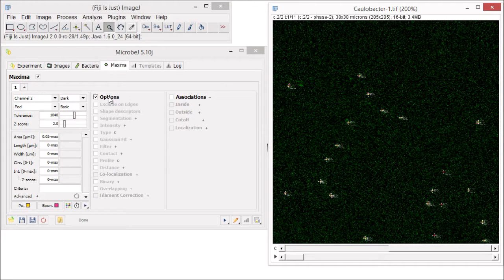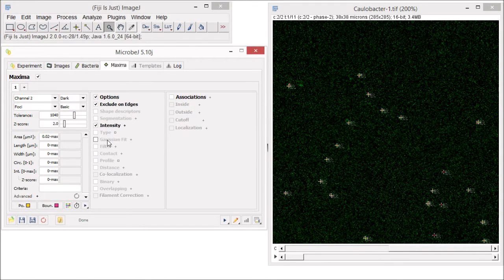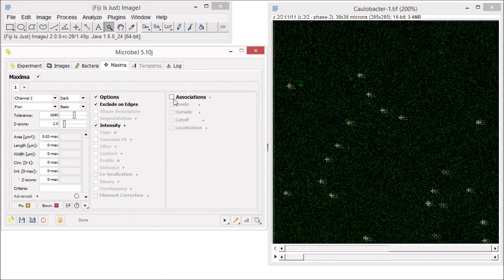Now let's select the options that we want to measure. There are many options that may be applied to detect maxima. For a description of all the options, please see the documentation on our website. For example, if you are interested in the fluorescence intensity of the detected foci, select Intensity, and all those attributes will be listed in the raw data table. If you are interested in the sub-pixel localization of the maxima, select the Gaussian Fit option. More interestingly, if you want to associate the maxima with the bacteria, select Association.